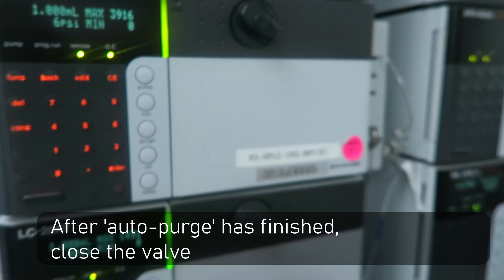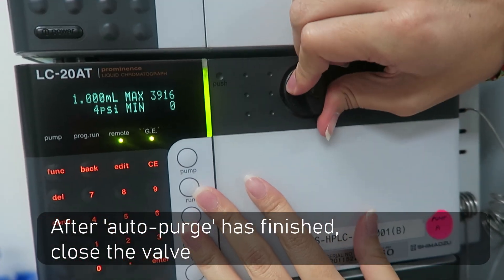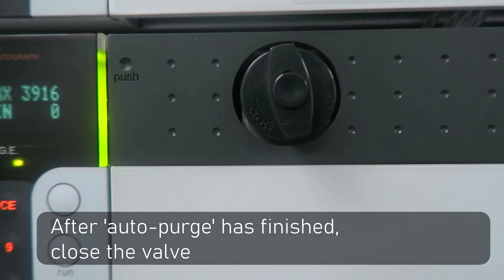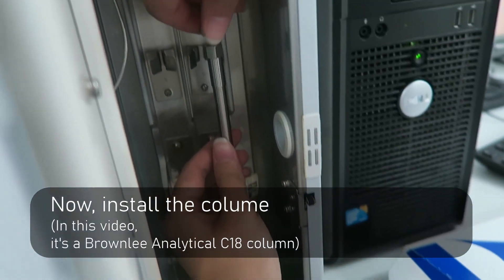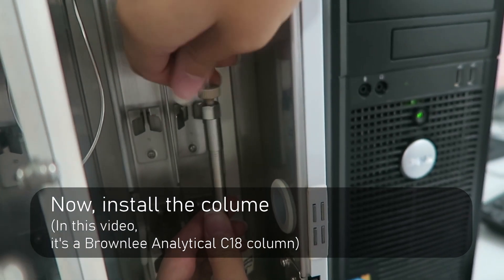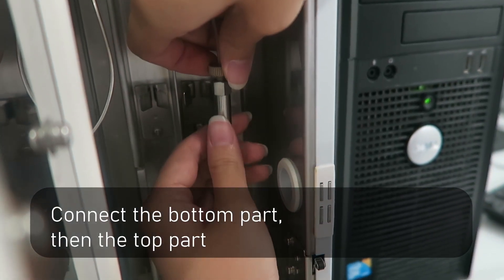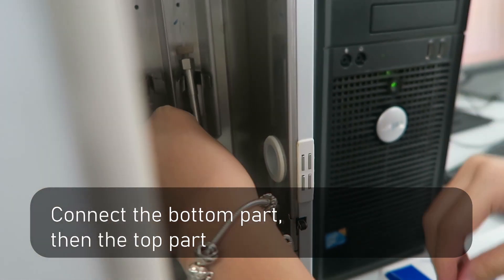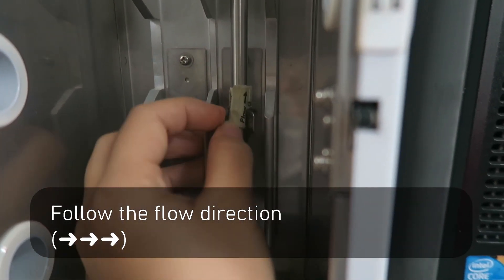After running, you can close the valves. Now you can install the column. In this video, this is a C18 column. Connect the bottom part first, then the top part. Remember to follow the flow direction.